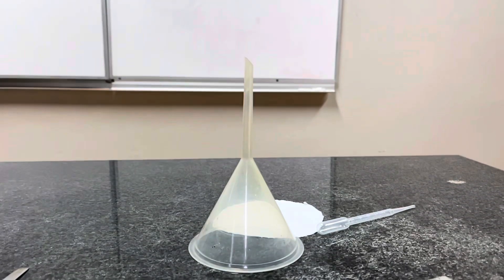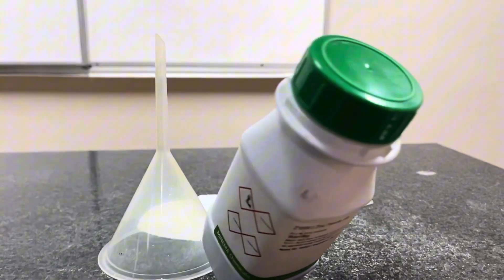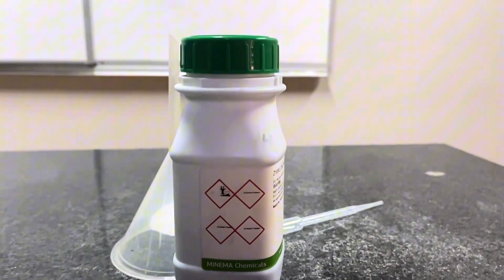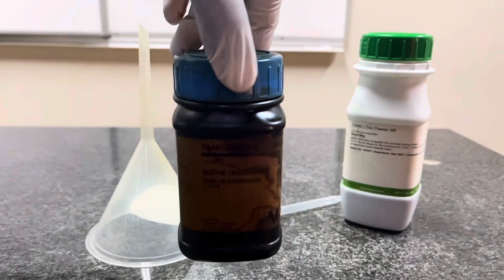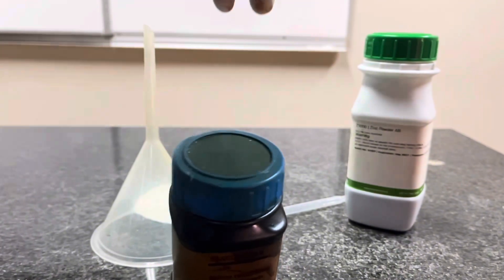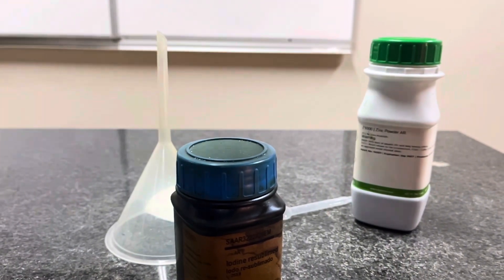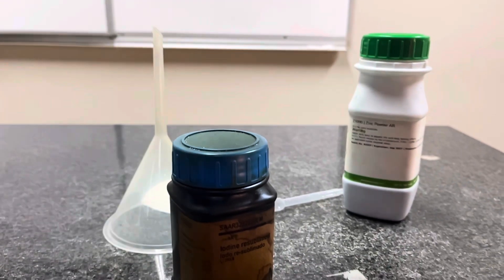In terms of chemicals, we have a bottle of zinc that is in powder form. We also have the iodine that is also in powder form. We also have the ethanol, which is a solvent. It's in liquid form. It's colorless. It looks more like water.